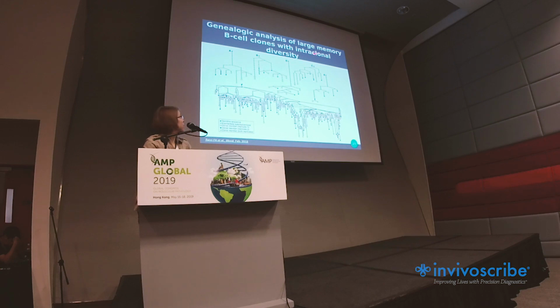Here you can see we also did some tree representations with IgTree. The root is always the baseline, the germline sequence. Then you have small dots here indicating the mutations, but we didn't find those sequences. And as squares, you have those sequences we found: in white in replicate 1, in black in replicate 2, and those in gray are found in both replicates.